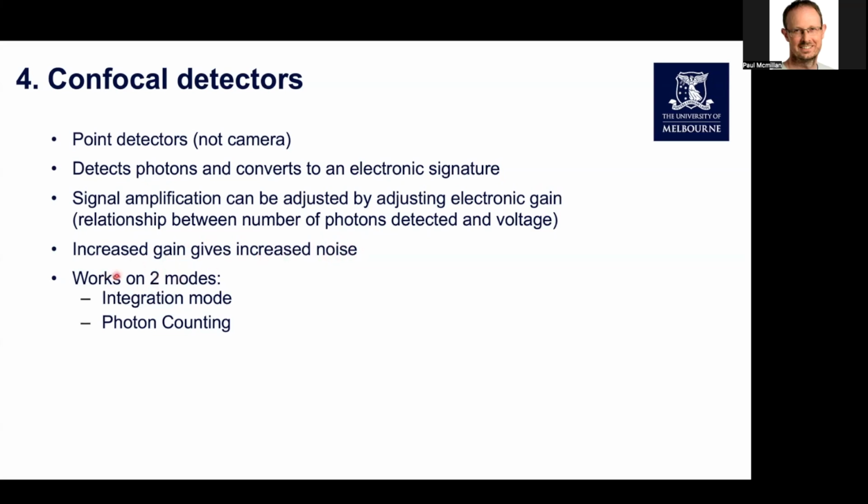And yeah, we can work in two different modes. Integration mode, where we're collecting signal and associating that with pixels, or photon counting mode, where we're trying to convert every photon that hits the detector into a photon count coming out. So we're a little bit more directly quantifying in that case.